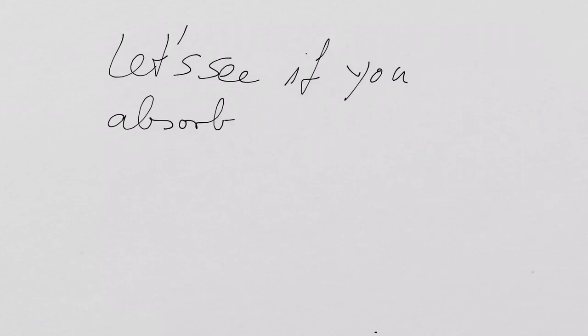It's just simply the electromagnetic radiation that I send out, that my Wi-Fi here sends out to the Apple TV down there, just simply goes straight through him. It has the wrong energy for any of the electrons to interact with. Yeah? If there is no absorbance, it just simply goes through.